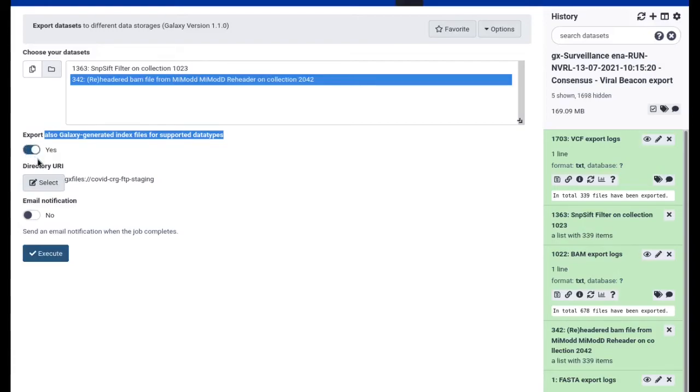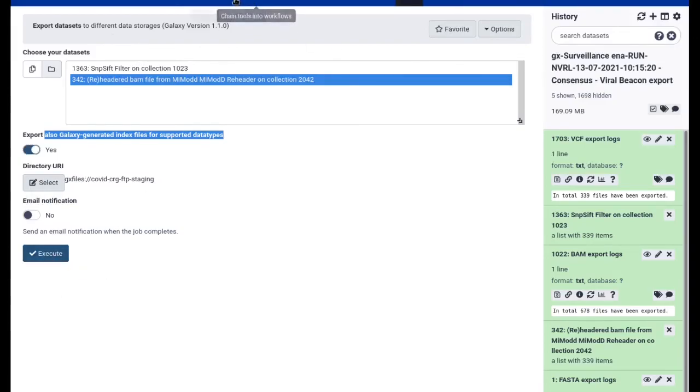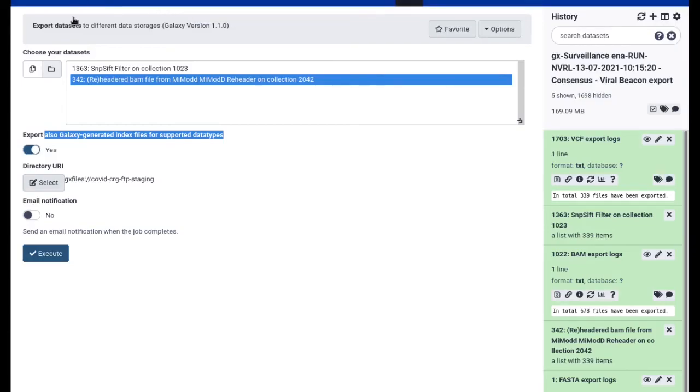This is to save compute time there because they do not have to be recalculated on the Spanish side. So this is how powerful this tool is, and it's really a great addition, very recent but great addition to the Galaxy toolbox.